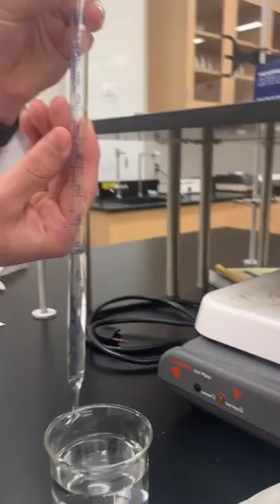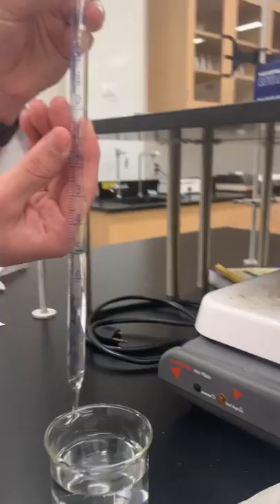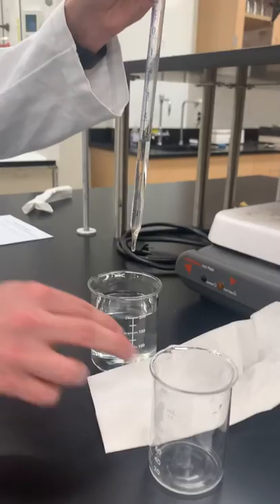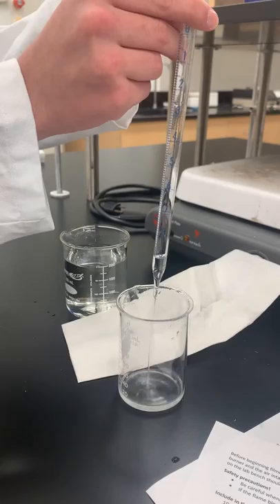So now you can see the meniscus is right at five, so I know that I have the proper amount. I'll wipe the outside with a paper towel so I don't get any excess water. So now I can just move it over, transfer the solution into my beaker over here, and voila — transferred five milliliters using the pipette.